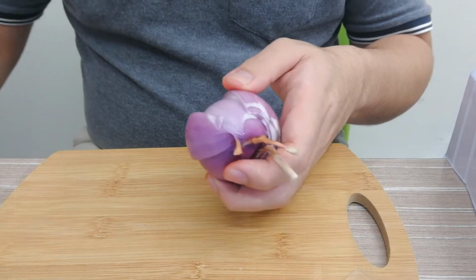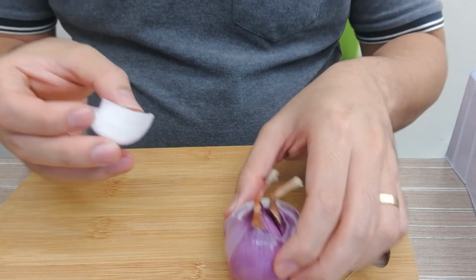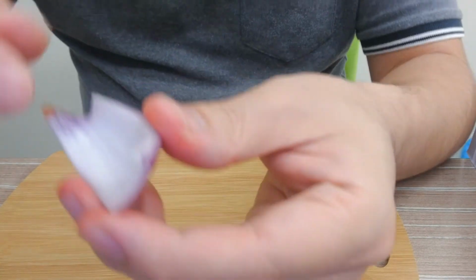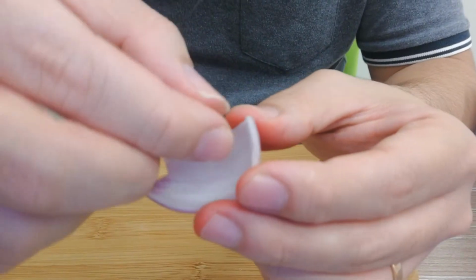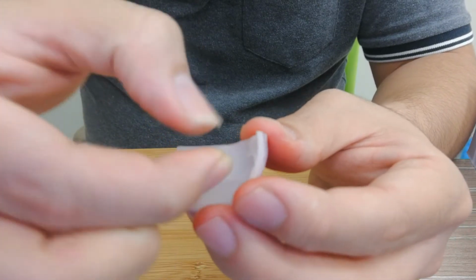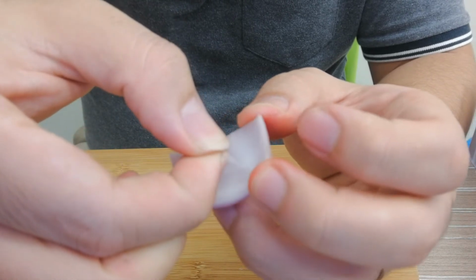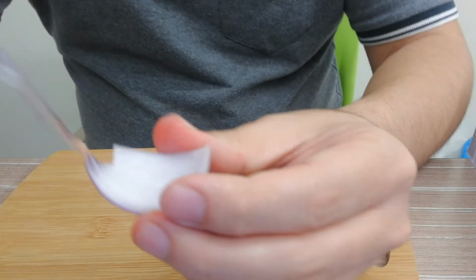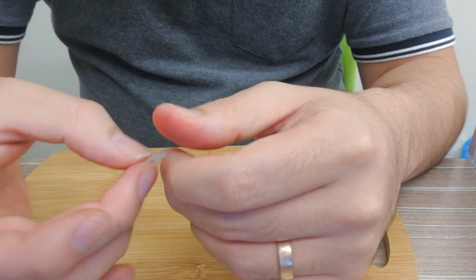Over here you can see the back of this onion skin. You need to peel up one thin layer of onion so that you can observe it from the microscope. You can use a fingernail or you can use forceps to peel this layer. Ta-da, see that? This layer will consist of the plant cell. There are many plant cells combined together on this skin, so basically there's a huge slice. You just need a small amount.